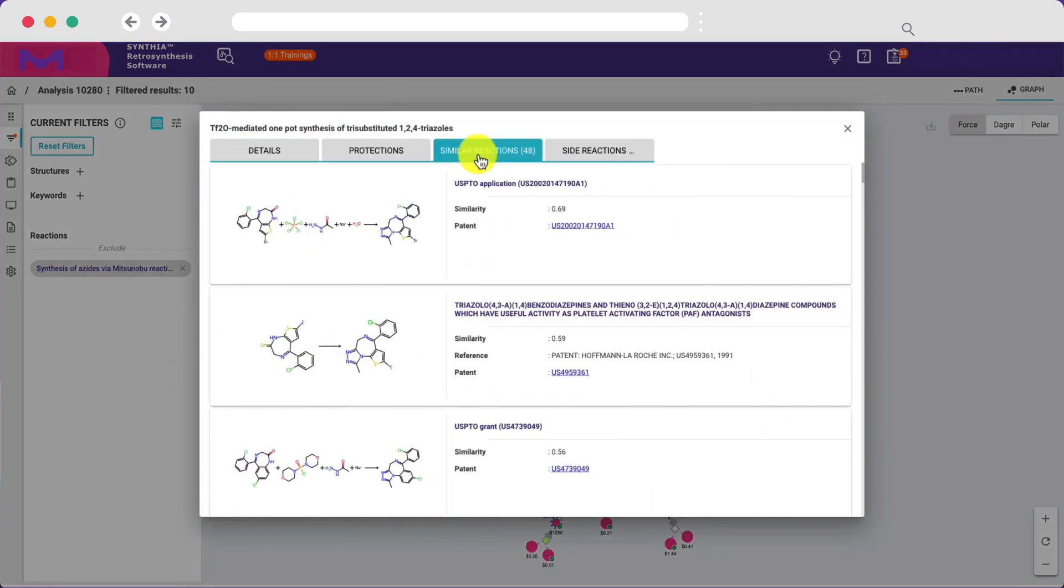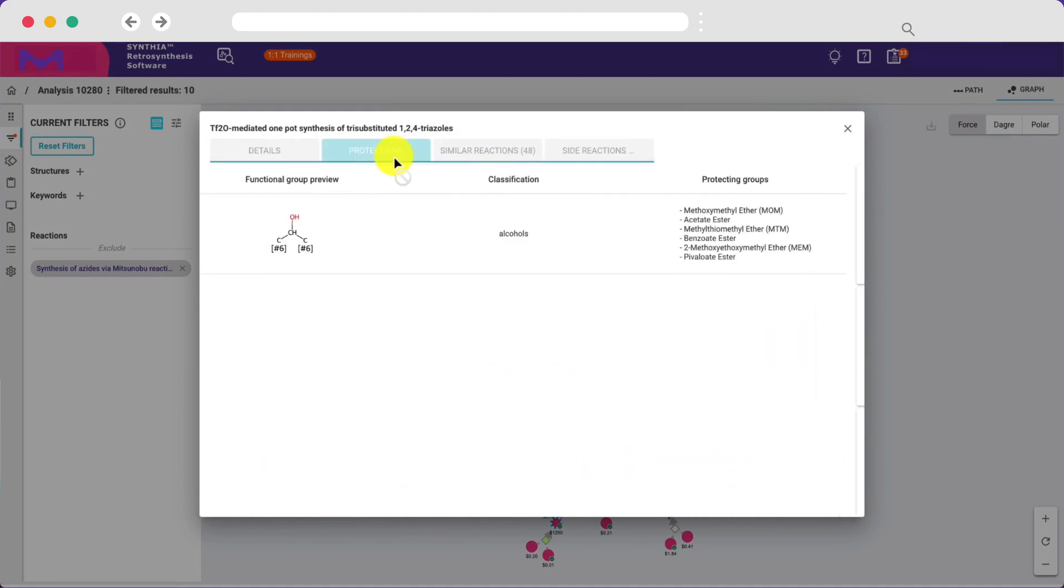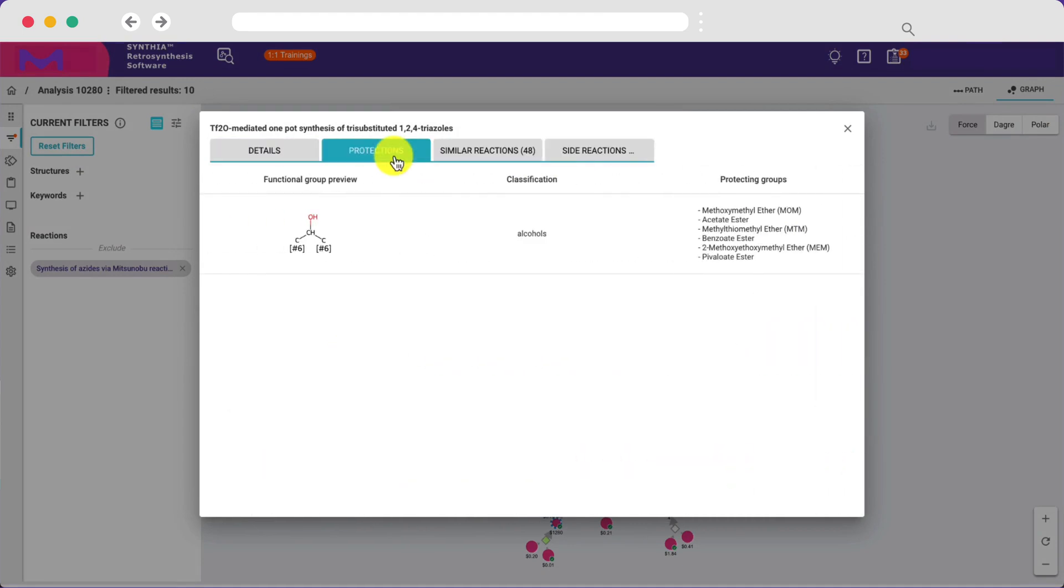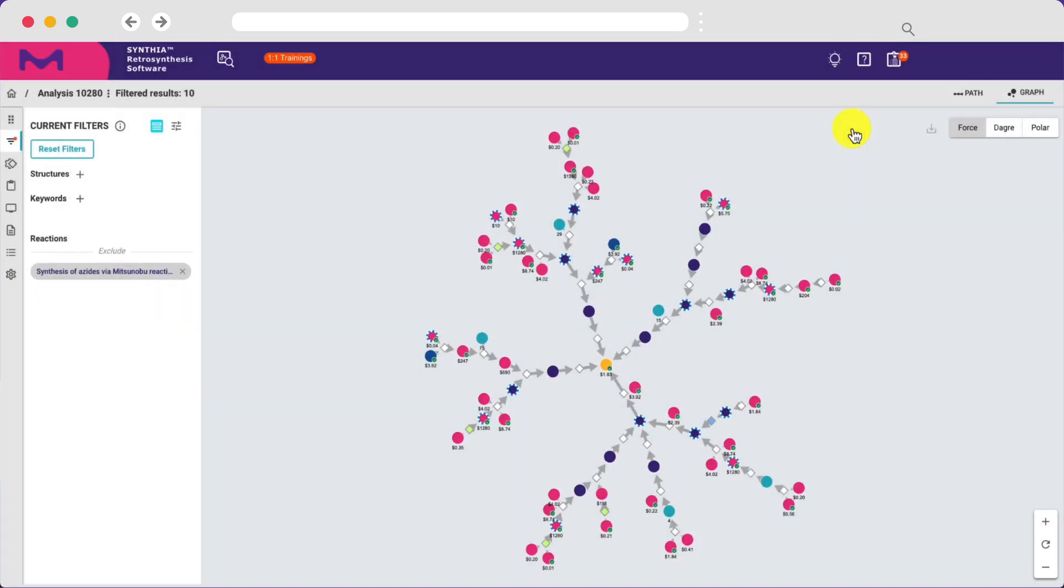When a protecting group is required, Cynthia specifies which functional group needs to be protected and which protecting groups are compatible with the proposed conditions.